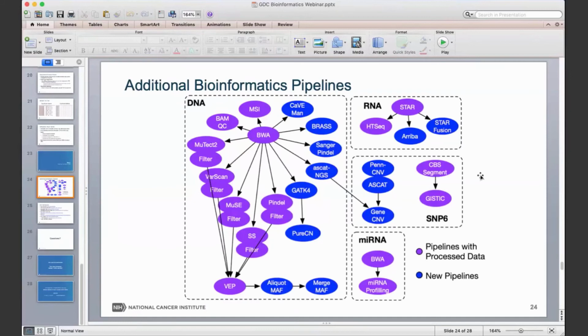But also, the sensitivity is dependent on tumor purity. So make sure if you have a less pure, more heterogeneous tumor sample, it's better to have a higher depth. If the tumor is 100% pure or very high purity, then a lower depth is normally not a problem.